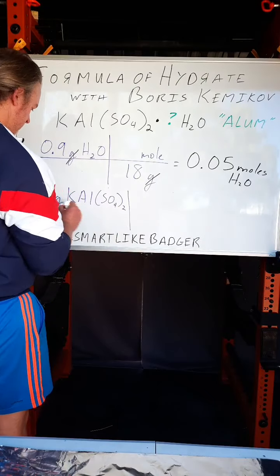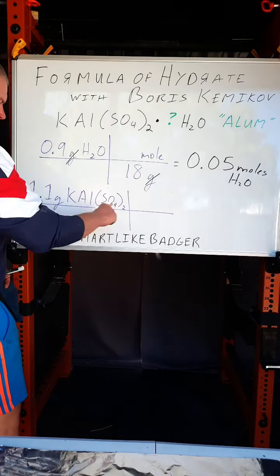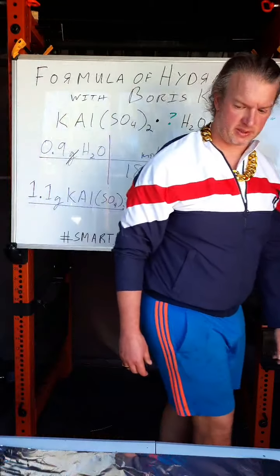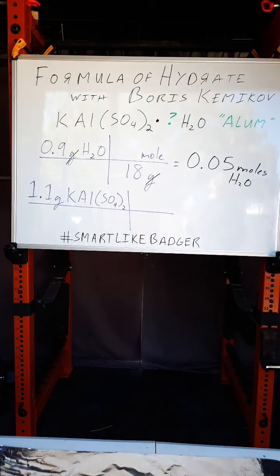And we want to know how many moles of this. So we have to add all of this up off the periodic table. Boris needs to get a Mendeleev table himself and a calculator.